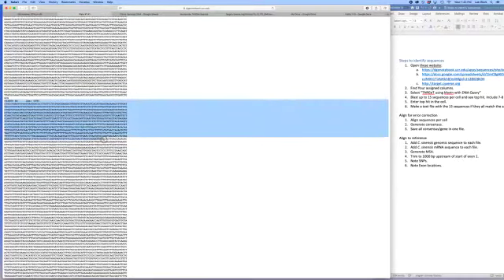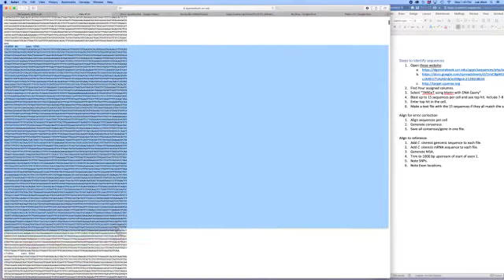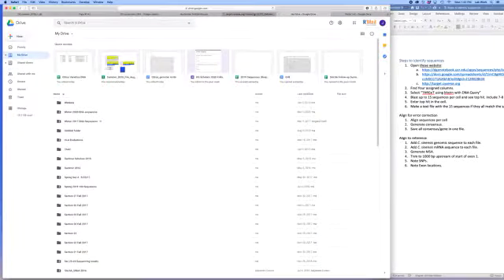That stands for reverse complement. So that means that my software programs identified this sequence as being on the opposite strand. So it was the result of the reverse primer. I have since then, instead of it being the reverse complement sequence to this, reversed it so that it should be identical to this. Let me show you what I mean, going in the same direction.